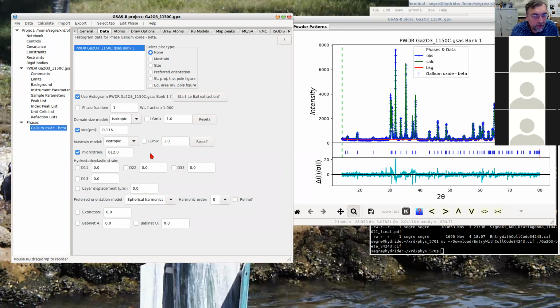And what I would do after this, as you may have noticed, I had a different file too. I had a file where we substituted 15% of the gallium-2, the two galliums, by iron. And we wanted to know if we get the same structure, because iron forms a hematite structure, Fe2O3, so it will probably only dope into the gallium a little bit.